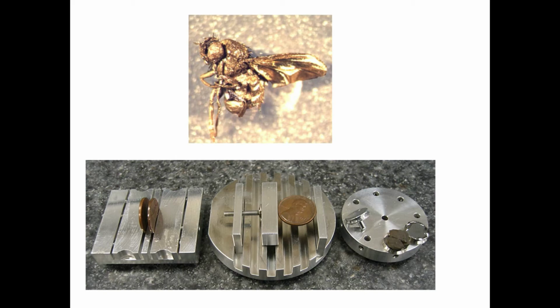Now let me tell the advantages and applications of SEM. The advantage, as already told, is high resolution, and there is a wide range of applications. Three-dimensional and topographical images can also be produced, and like XRD you can get microstructure directly and surface information correctly, and you can get the elemental information also, when operated with proper training and with advances in computer technology, which give very clear images. And if any surface irregularity is present, that can also be adjusted with the same equipment, not an issue.